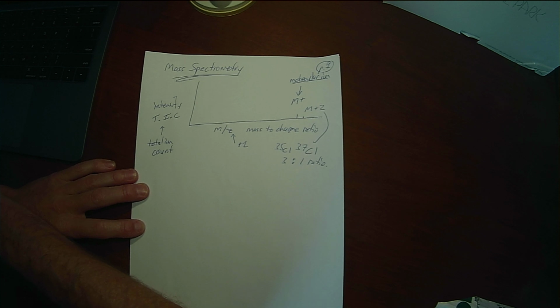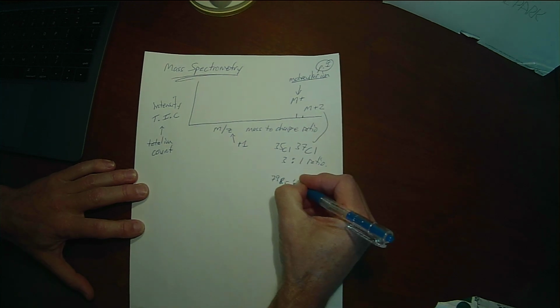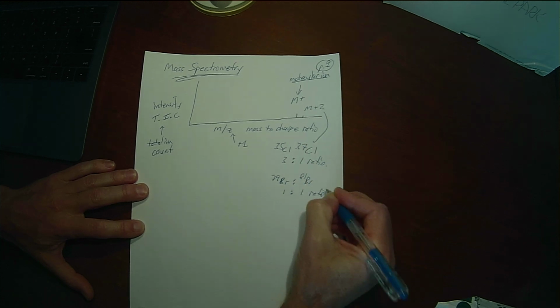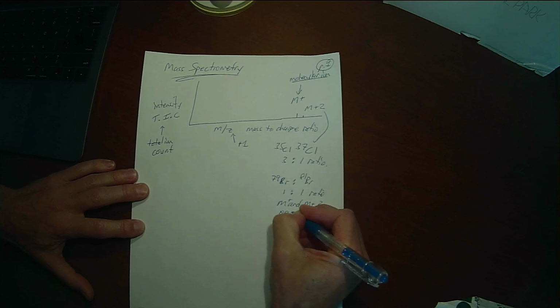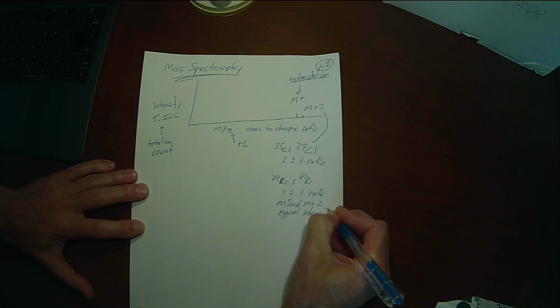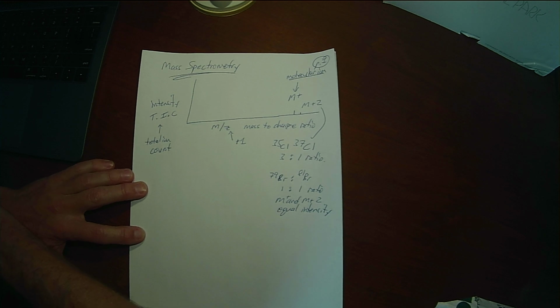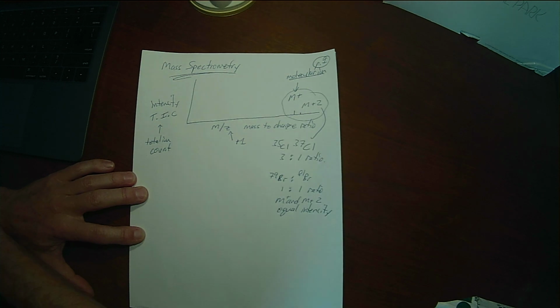When we see an M+ and an M+2 that are in about a 1-to-1 ratio, that's very distinctive for bromine, because bromine has two isotopes, 79 bromine and 81 bromine. And those are usually in a 1-to-1 ratio, which means we see M and M+2 in equal intensities. And then actually for sulfur, because sulfur 34 is about 4% natural abundance, we'll also see an M+2 peak, but it'll be significantly smaller. So the molecular ion region of the spectrum is a region you can look at to determine what heteroatoms might be present, chlorine, bromine, sulfur, things like that.